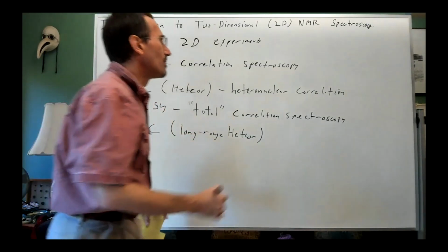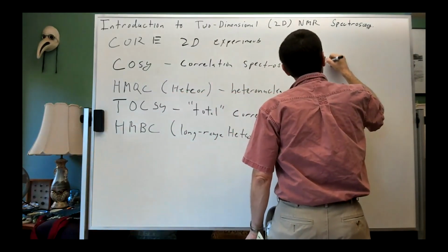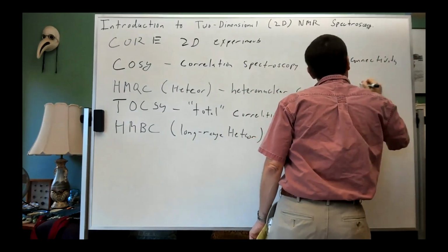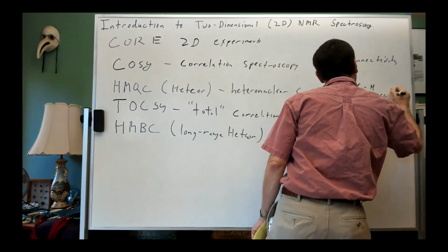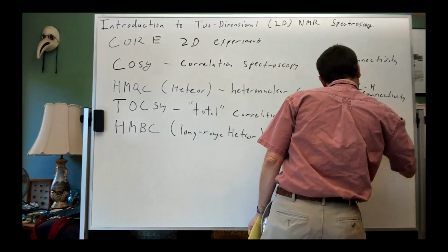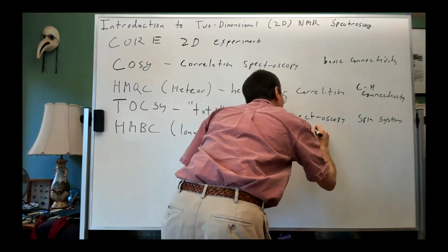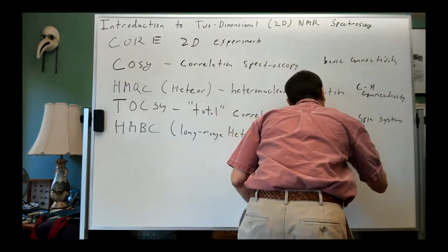So maybe if I were annotating these, I'd say basic connectivity, CH connectivity, spin systems. I'll say putting the pieces together, and I'll talk more about this in a few lectures.